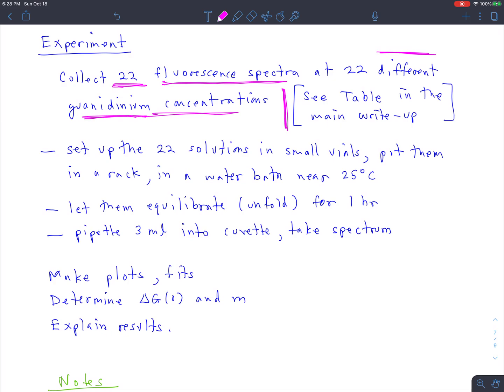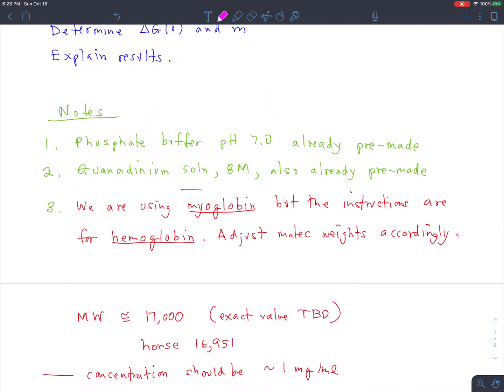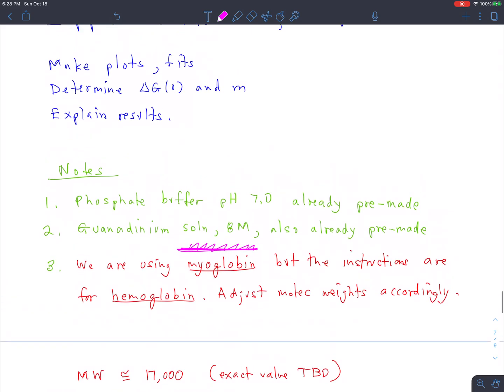Let me say something right now because it's important. The write-up is for hemoglobin, but I switched to myoglobin this semester. I hope that doesn't cause trouble. I haven't tested it, I confess. I'm assuming that myoglobin will behave pretty much the same as hemoglobin. I switched to myoglobin because hemoglobin is a tetramer of myoglobins, basically. Each of these ones is basically a myo, and hemoglobin is the whole thing.